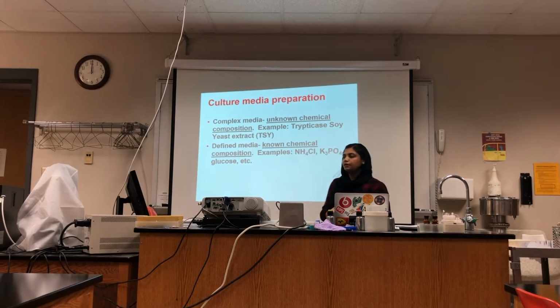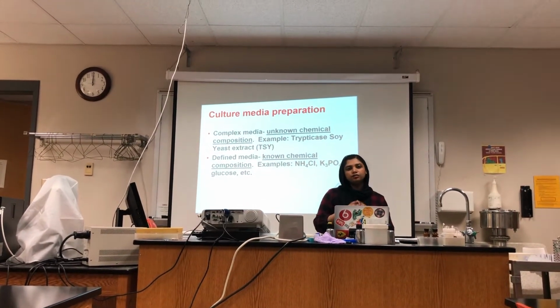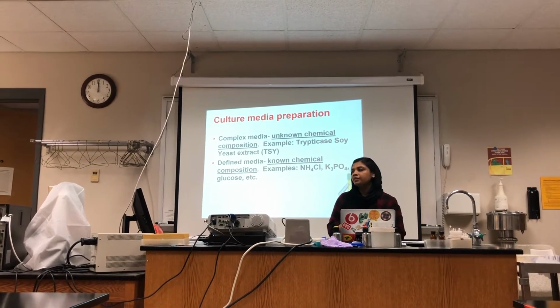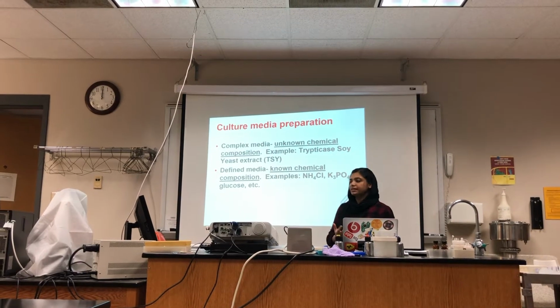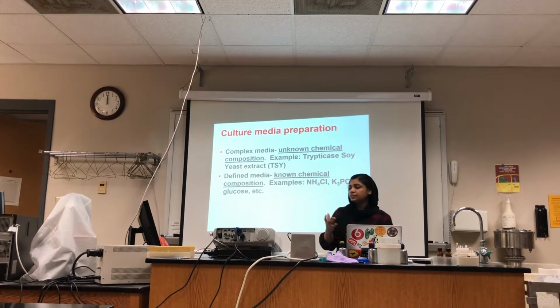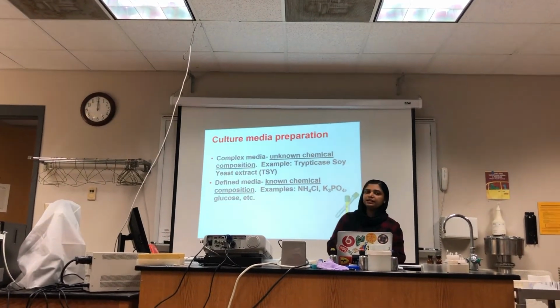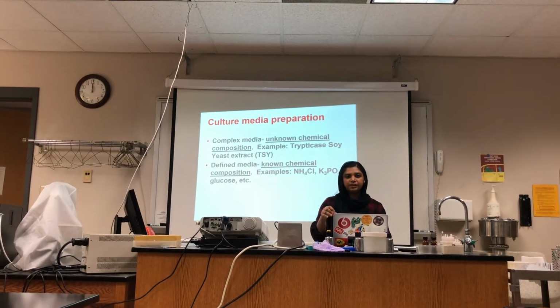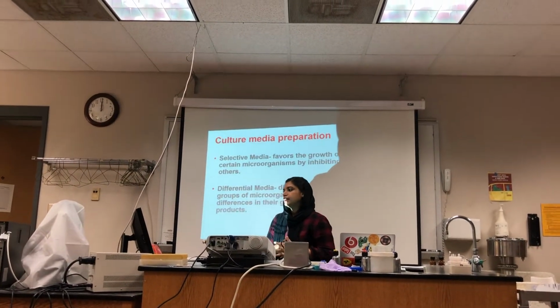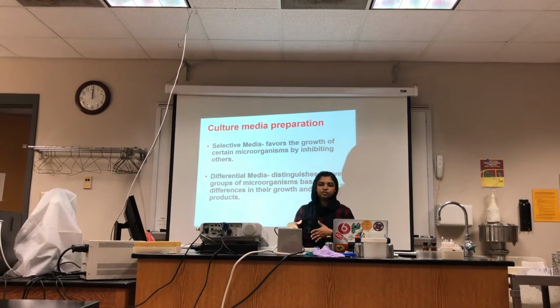One is a complex media and the other is a defined media. Complex media is like unknown media. We don't know the actual composition of that media. For example, trypticase soy yeast extract that we are using today, TSY. And then the other one is a defined media, where the actual composition of the media is very well known. An example is glucose.